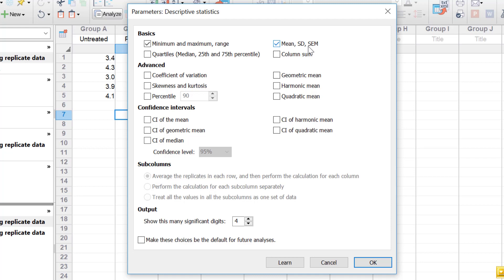There's also the mean, which is the arithmetic mean or average; the standard deviation, which is the amount of variation or dispersion of the data; and the standard error of the mean, which is a measure of the dispersion of sample means around the population mean — this takes into account the n number, so how many replicates or data points you have in each column. There are also quartiles: the median, which is the 50th percentile or the middle number in the data set; the 25th percentile, which is the first quarter of the data; and the 75th percentile, which is the third quarter.